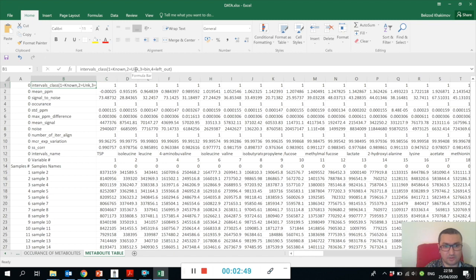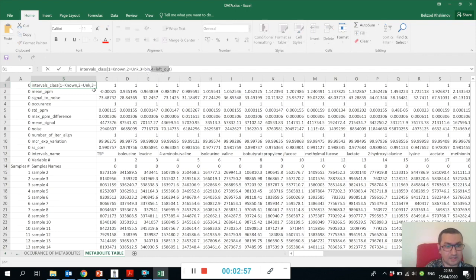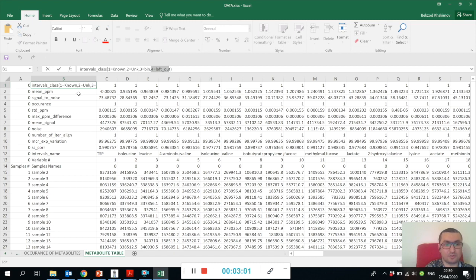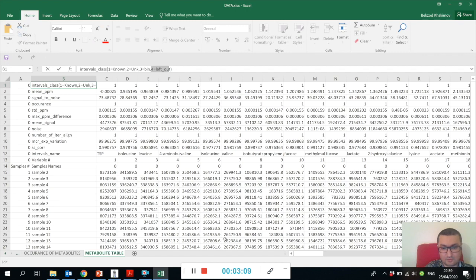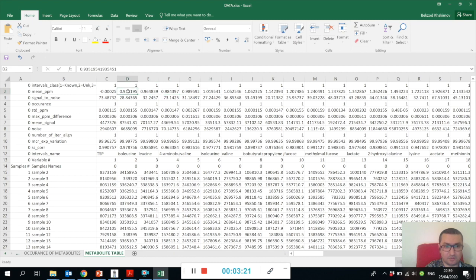From row 1 till 13, we have all the information about the variables, and then we have the samples starting from row 15. We have a metabolite class - one is signature signals which are the known metabolites, two is 'source' (unknown signals), and three is the bins. We also have class four, which will only become available if you choose to include the left-out ppm regions during processing.